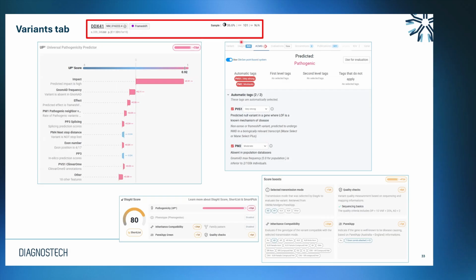And then we're moving on to the DIAG AI. So this is really SeqOne's AI prediction tool. And that's where these 3 windows here come from. So starting at the bottom, when I click DIAG AI, it's going to open up and give me the DIAG AI score. This is a score from 0 to 100, 100 being the most pathogenic. And it's using certain in silico tools and databases to basically call whether this gene is pathogenic or not.